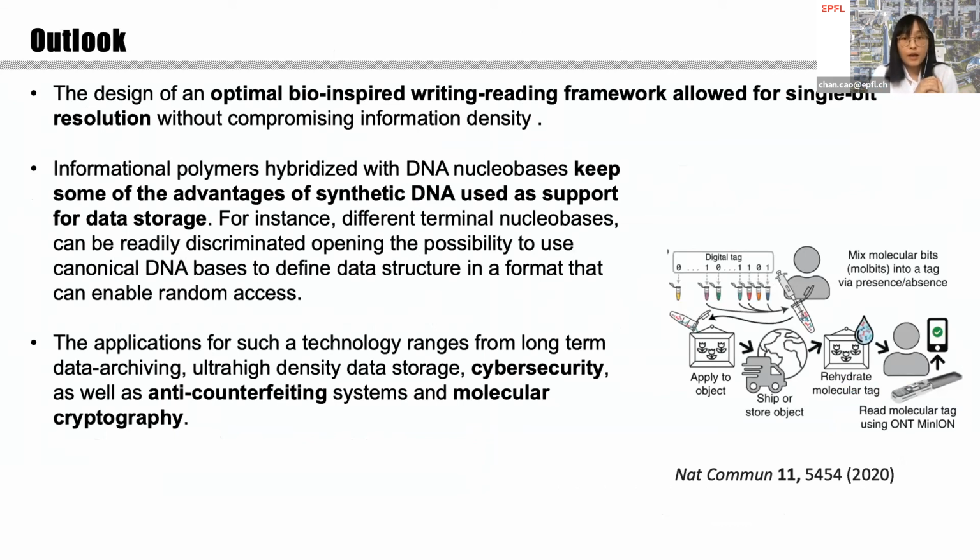For this, I hope I convinced you that this bio-inspired writing and reading platform we have developed can be a solution for data storage. And of course, it's not limited to data storage. Before we really reach there, it can also be used for cybersecurity or anti-counterfeiting systems, which are based on molecules.